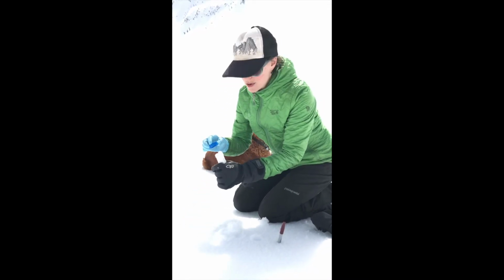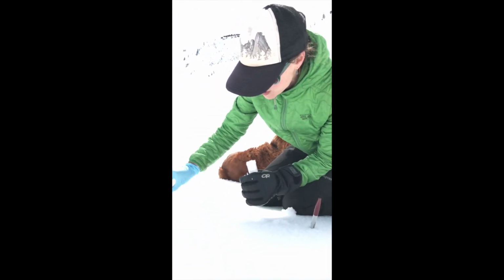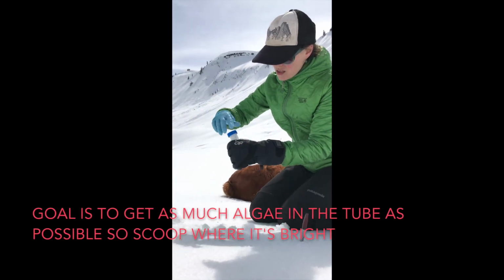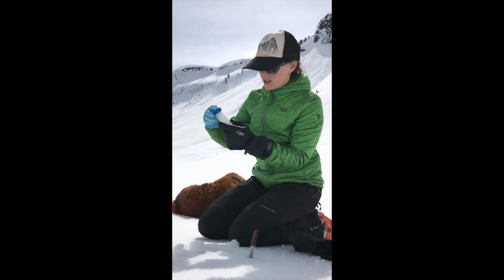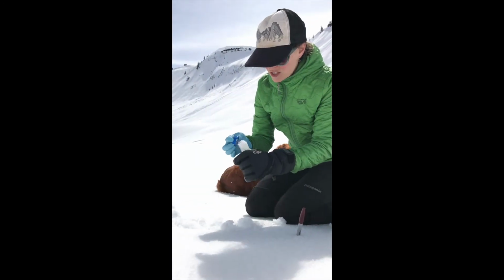Sometimes you'll see that the snow algae is a little bit darker right under the surface, and that's okay. If there's kind of crud on the surface, you can move the surface away and then scoop pristine snow. And I'll do that just a few times just to get as much snow as possible in the tube. That seems to be almost fully filled. Usually takes about 3 times.